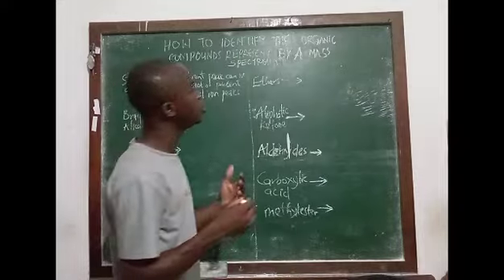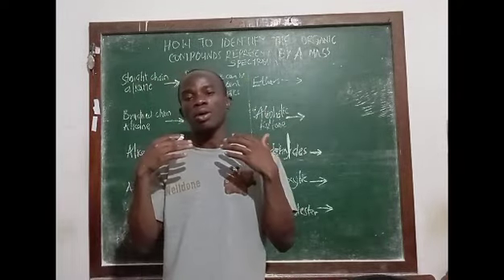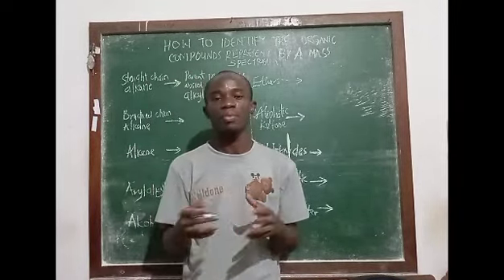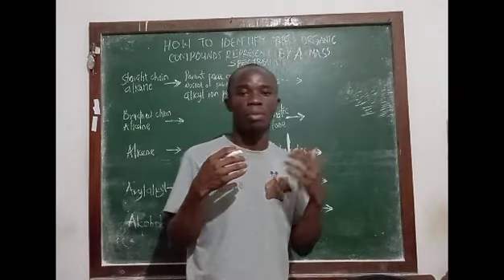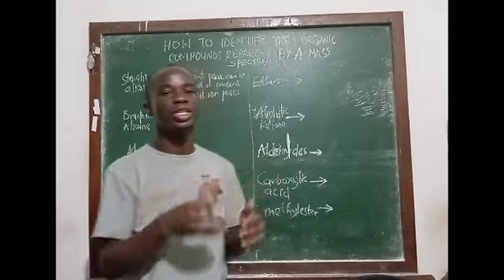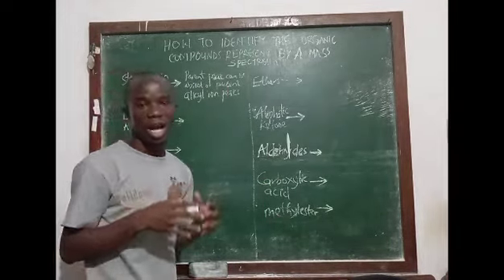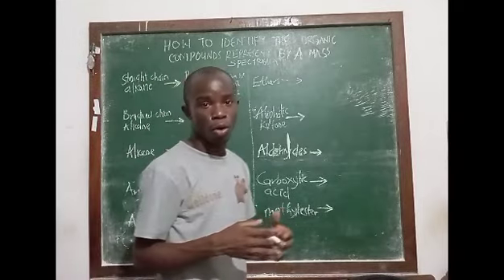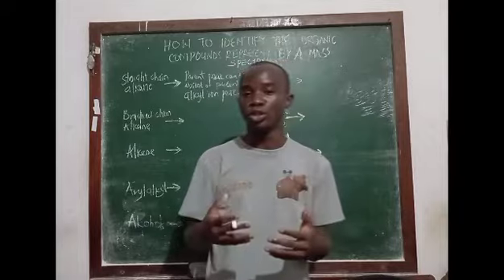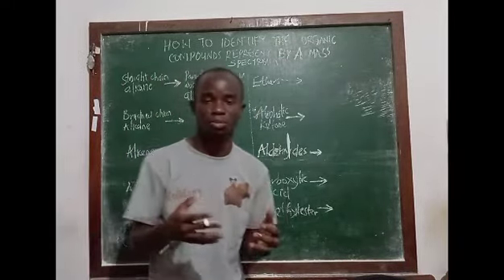We are talking about methyl, ethyl, propyl, butyl, pentyl, hexyl, etc. Each of the mentioned alkyls can always produce a signal in the mass spectrum of a straight chain alkane, although not all these alkyls produced as a cation will have a prominent peak.